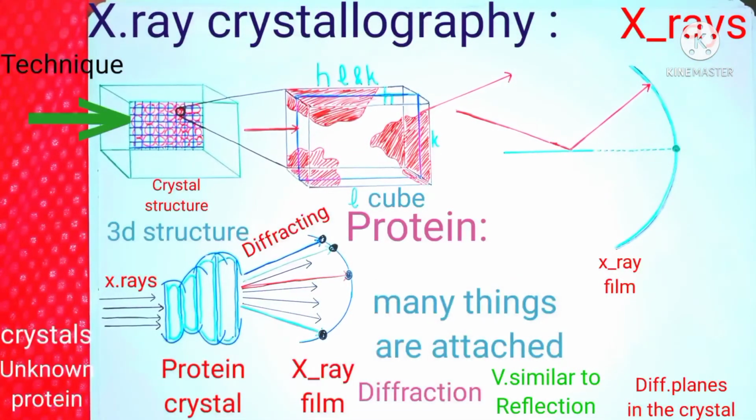So here the first diffraction is at this point. Let's say this is the first diffraction from plane number 1. Actually, they have different numbers of planes based on how we dissect the diffraction lengths. So in this case, plane number 1 will be 200. From this plane, 200, we get the diffraction at this specific point only.